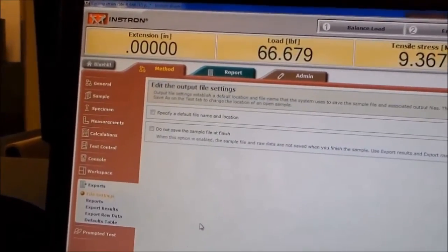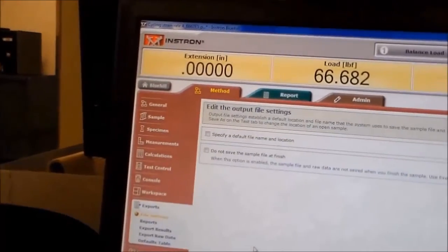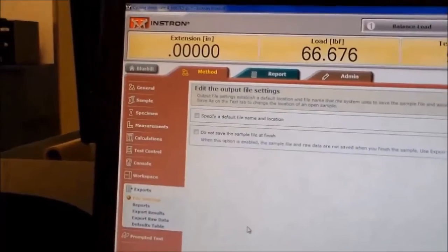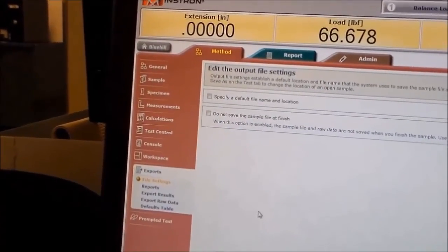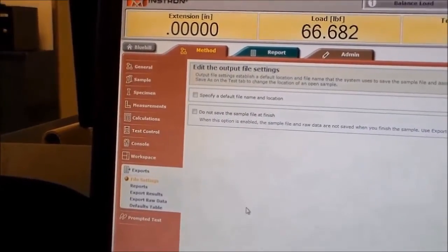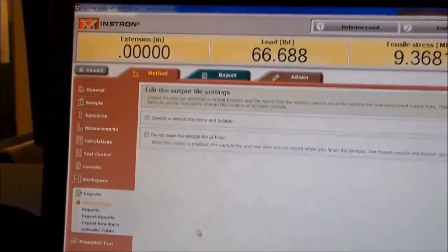So this is a good example, but again, when you write your method for the first time, have someone by you who has written a method before, and gain some experience. Use the easiest one and then try your own. It should work well. Good luck.